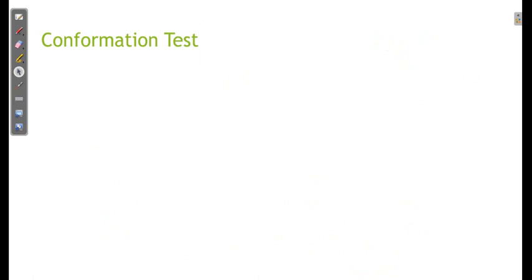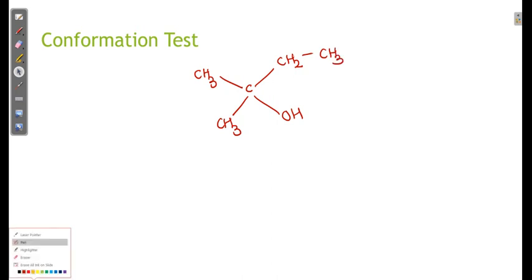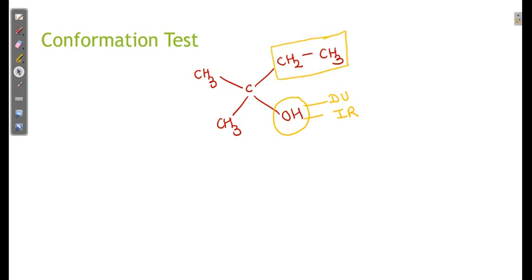So the formula we are getting is CH3, CH3, then OH, CH2 and CH3. Let us confirm how it is concluded. This is confirmed from the degree of unsaturation and IR. Then this is confirmed mostly from NMR. This too is also confirmed from the NMR.